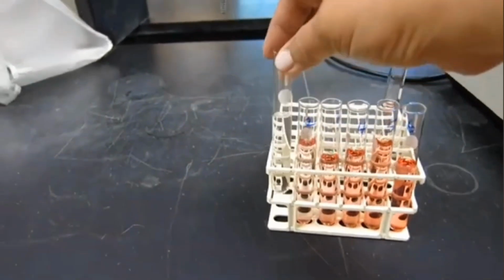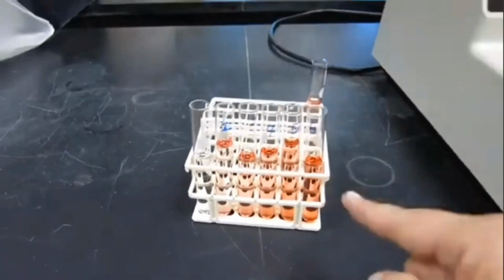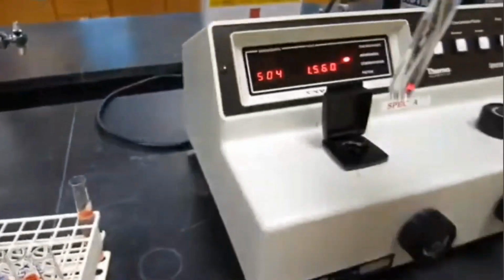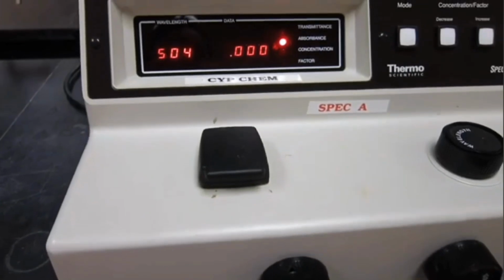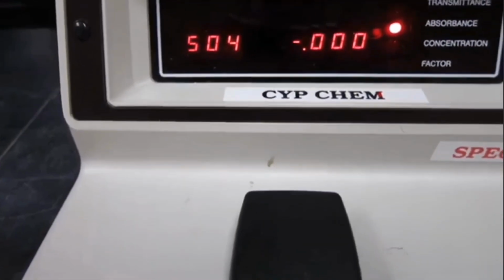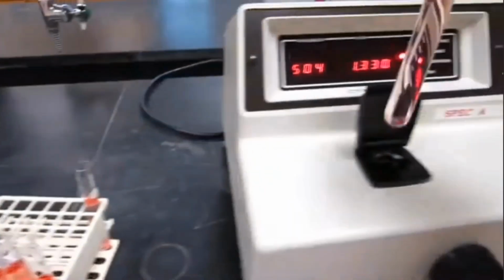And these are going to be little cuvettes. These are the ones we are normally using for the spectrophotometer. So to draw the calibration curve, we need first 6 solutions. Once you take your solutions to cuvettes, we're going to go ahead and put it inside the spectrophotometer and read the absorbance.